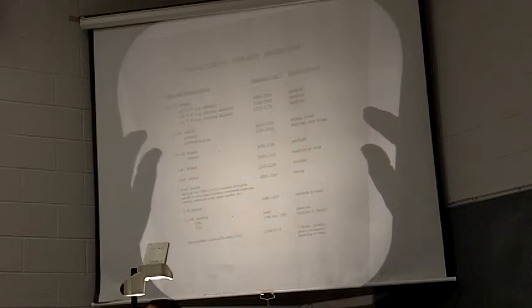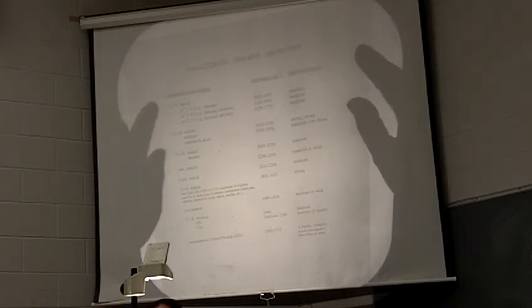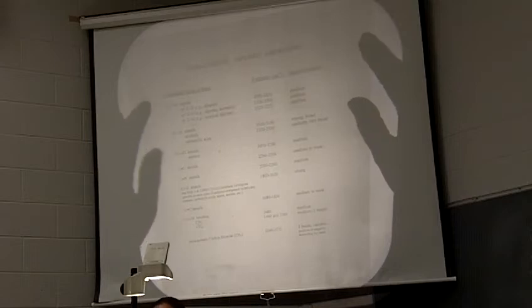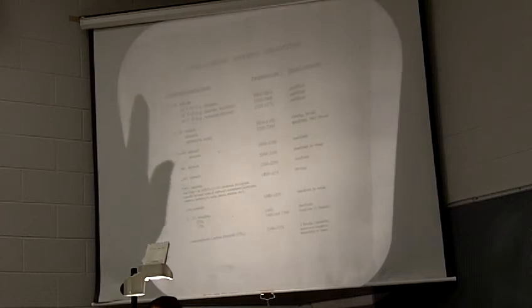Yep. When you say peaks, are they like inverse peaks? They drop down, so they're peaks that drop down. And you refer to them as peaks. That's what they are. Okay. So the units are wave numbers or inverse centimeters, and they are peaks is what you're talking about. Okay. So this is the table you just got.